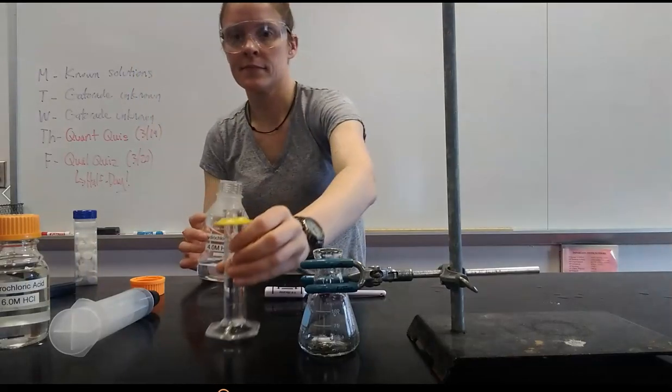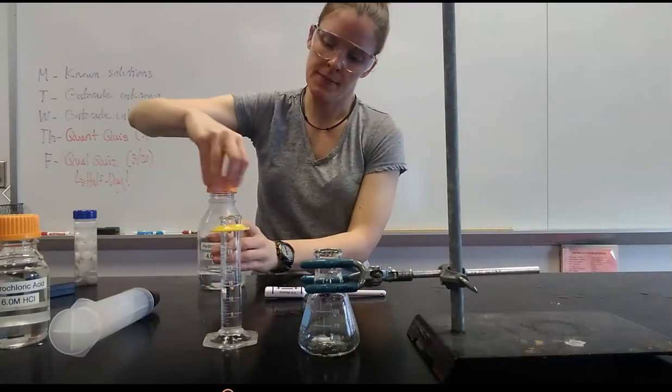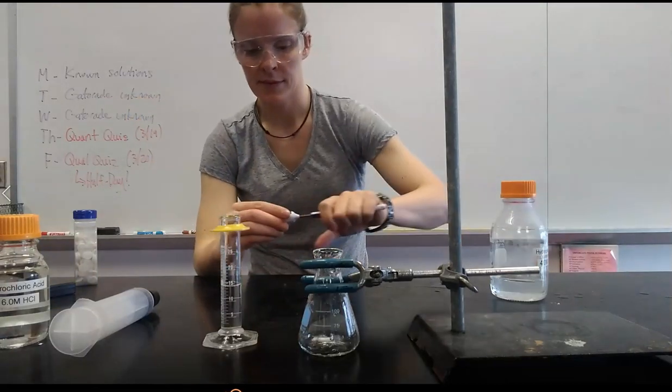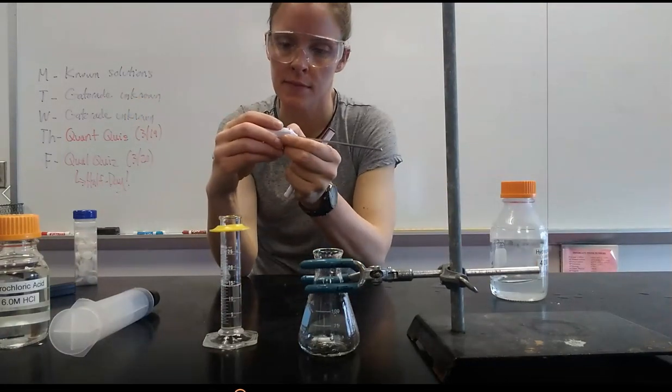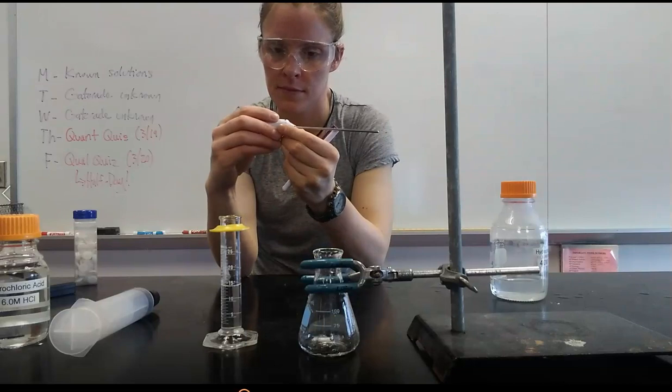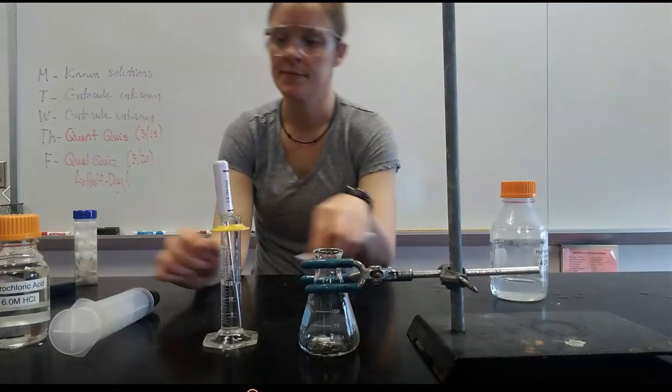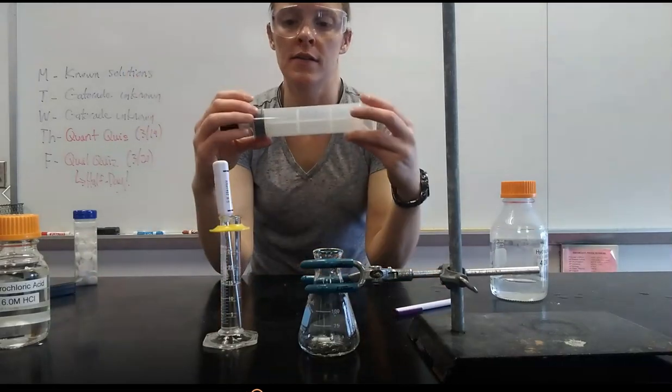Once you've got that measured, make sure you're capping solutions and you're going to measure the temperature. So we've got the digital thermometers, turn it on, make sure it's measuring in degrees Celsius and just get that sitting in the graduated cylinder of acid.